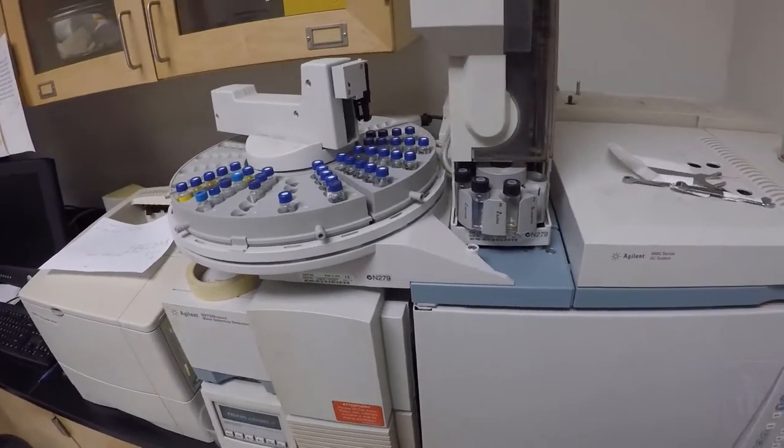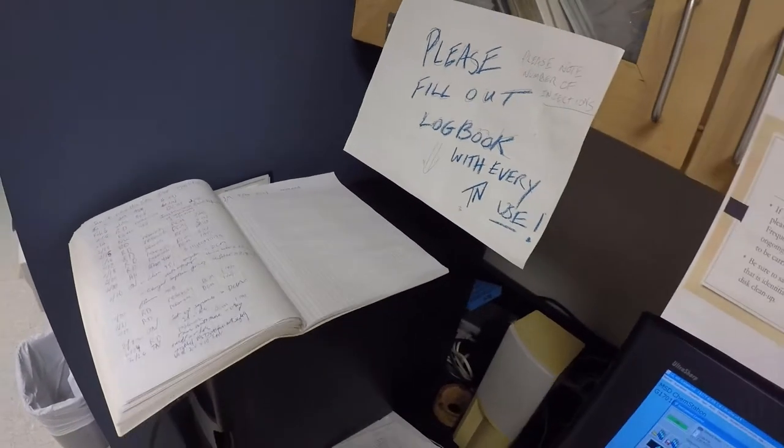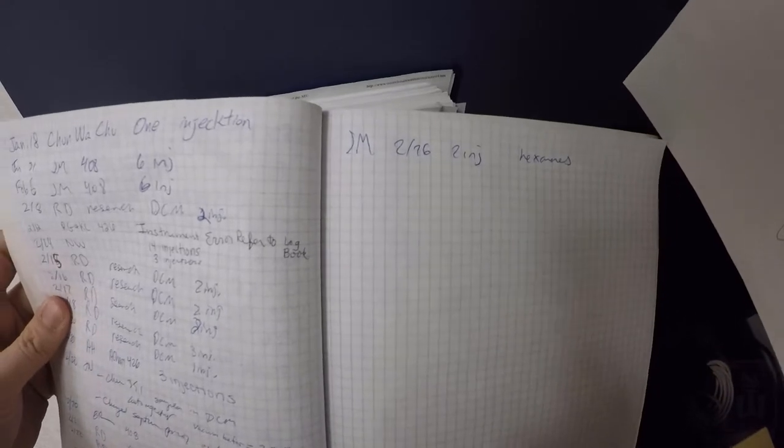And now we'll go ahead and set up our program. Another key important thing, as you can see, is to fill out the logbook. So I have filled out JM226, two injections, and my solvent. So be sure you always do that when you're doing these. Make sure you're signing up so that we know how often the instrument's being used. If you need to, you can say CHEM 408, just so we know who is associated with it and who to yell at if something gets messed up.